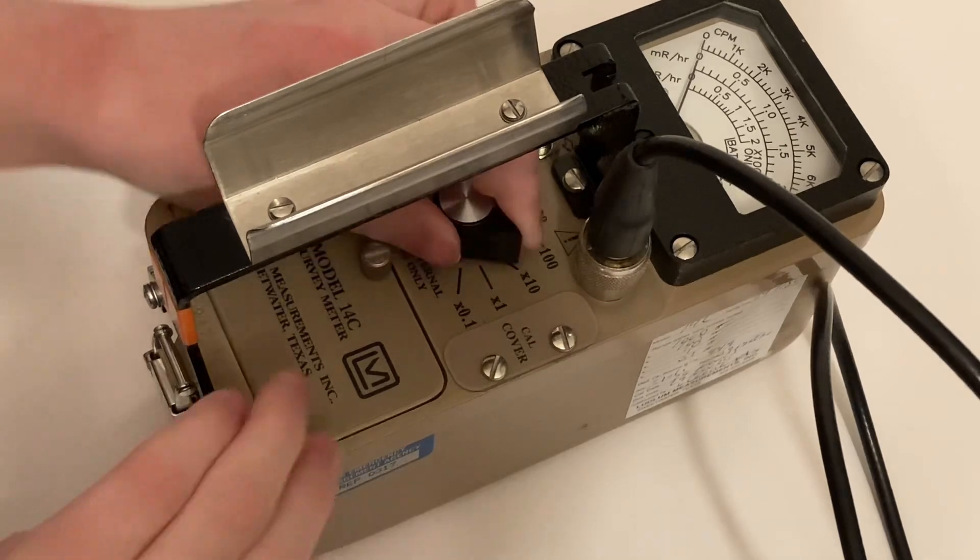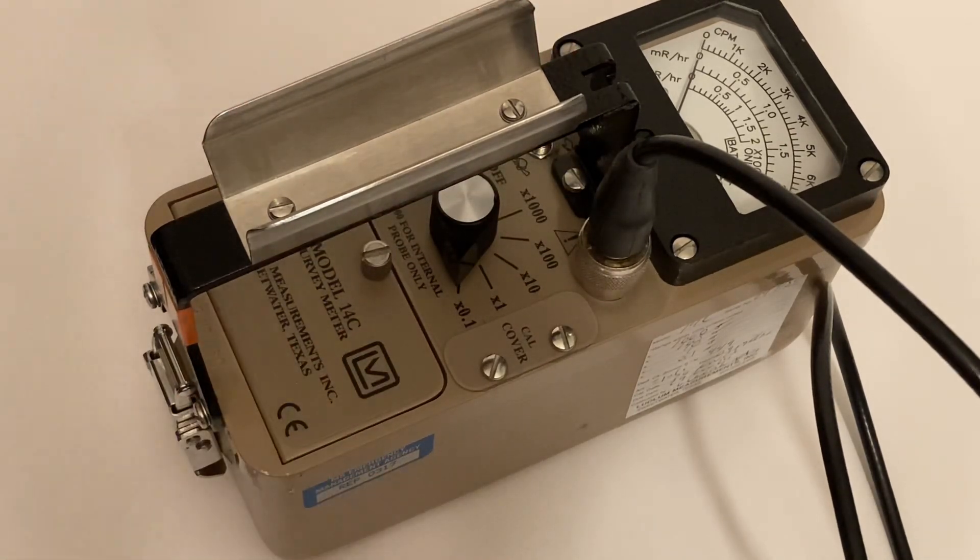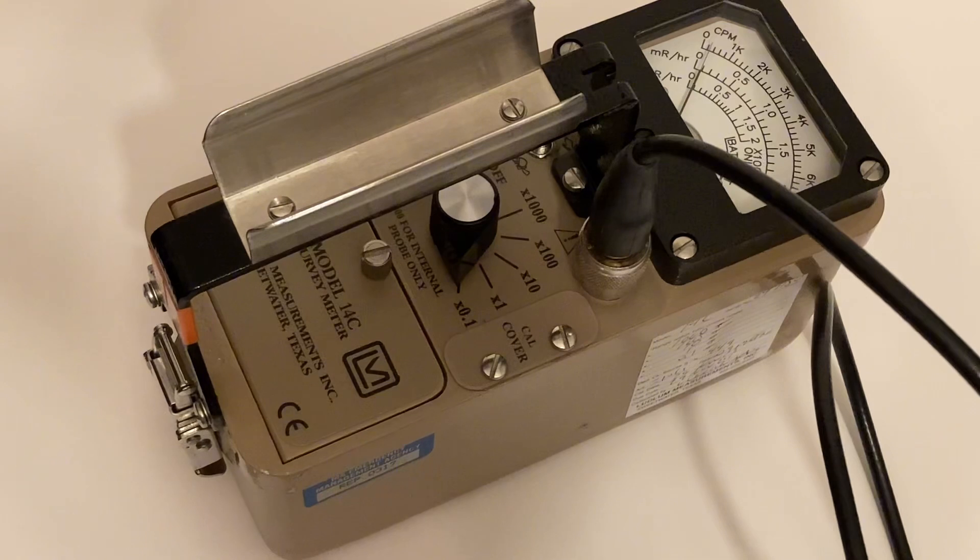Turn the rotary switch from the off position to the x0.1 position, which is the lowest range on the survey meter. You will hear occasional beeps from the survey meter just as a result of background radiation.